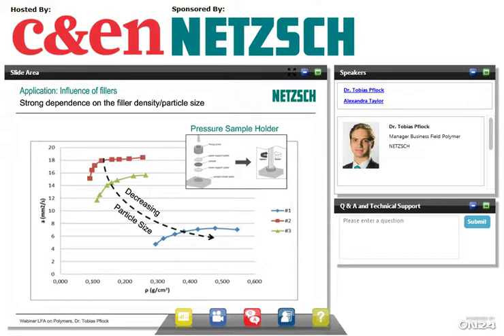What we did here is we looked at 3 different filler materials. So number 1 in blue, number 2 in red, and number 3. So this is just the 3 different materials. And it's shown in this black dashed arrow already. We have a decreasing particle size between these different materials. And what we now do is we increase the density. Well, how do we do this?